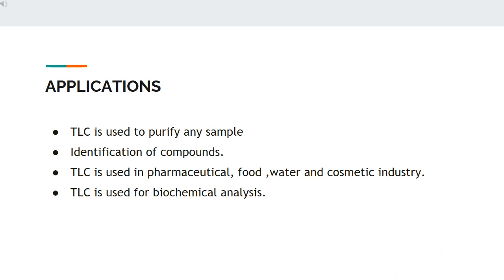Applications of TLC. TLC is widely used by many industries and research fields, including pharmaceuticals, clinical testing, environmental toxicology, food, water, and pesticide analysis, cosmetics, etc. Typical applications of TLC include analysis of drug residues and antibiotics in food and environmental samples, identification and quantification of colors, ingredients, preservatives, and sweetening agents in food and cosmetic products, quality control and purity testing of pharmaceutical formulations, rapid, high throughput screening prior to HPLC, and examination of chemical reactions for completion.